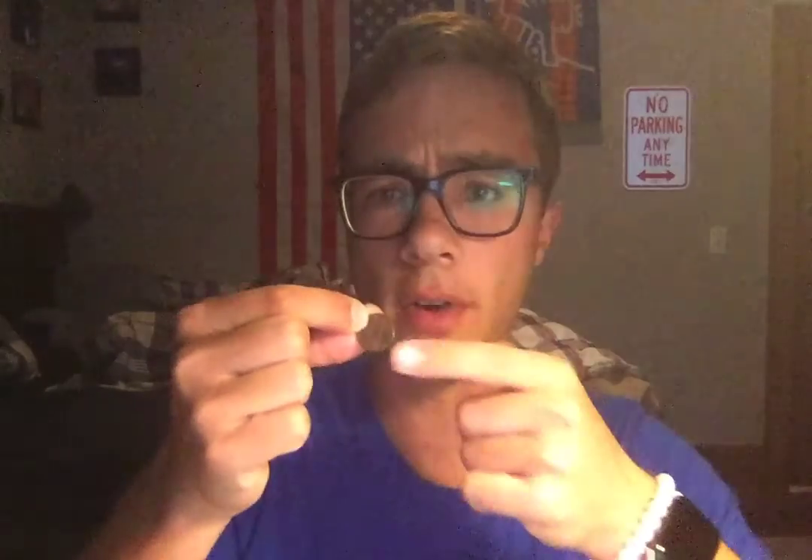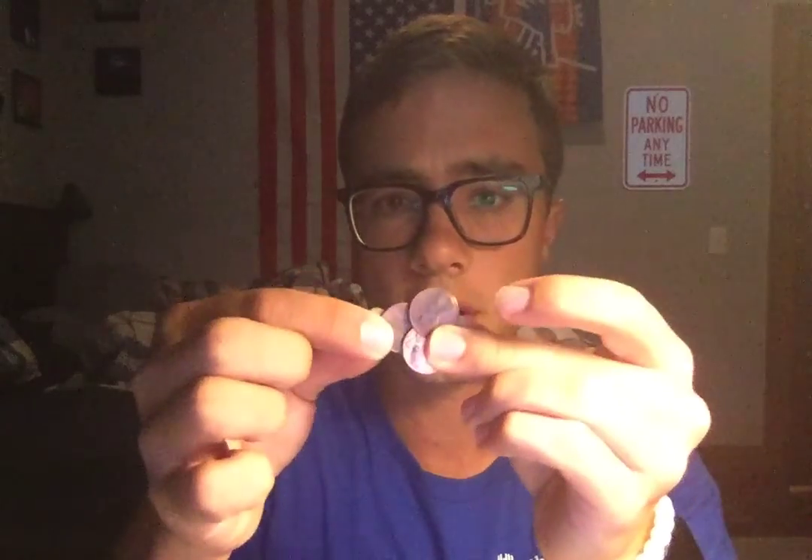So for this week's experiment, we are going to be taking a penny and trying to remove all of the black rust and everything on it. As you can see, this one's decently dirty. I tried to find ones that were pretty dirty. This bottom one's not too dirty, but these other ones do have a lot of rust on them.